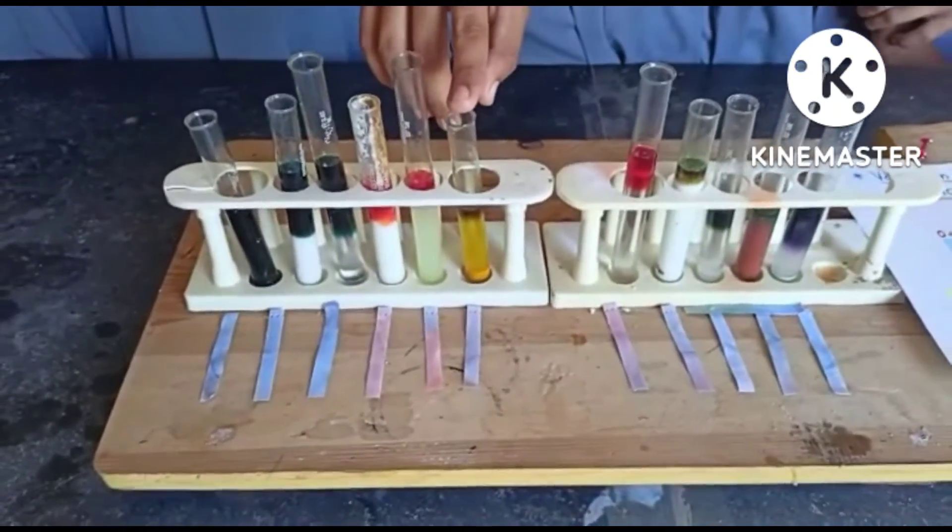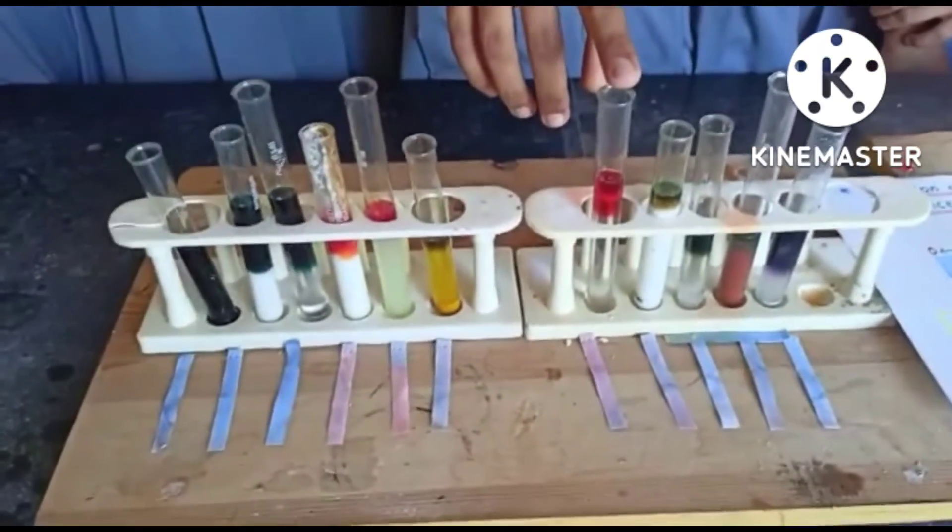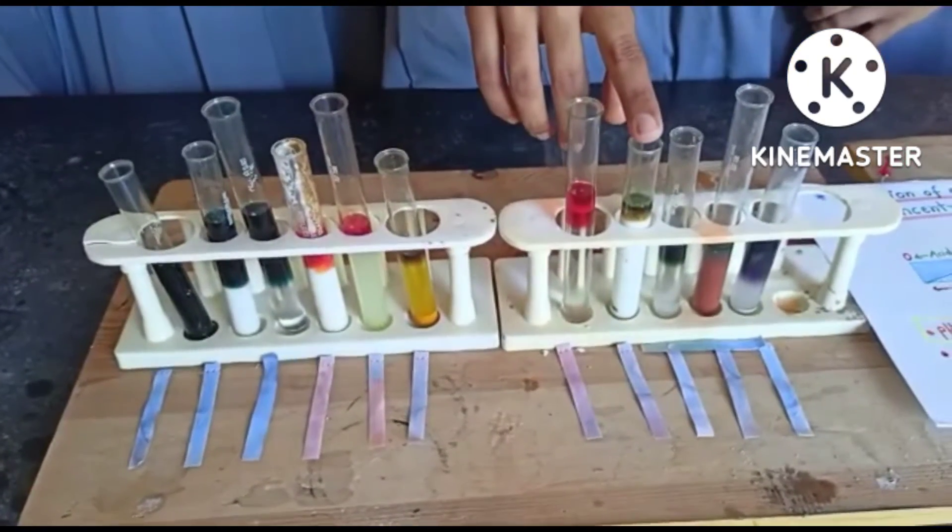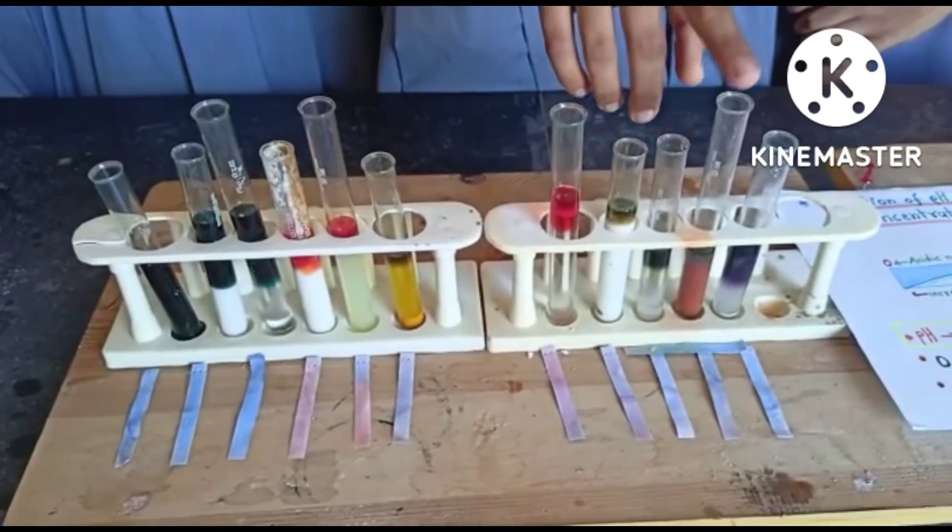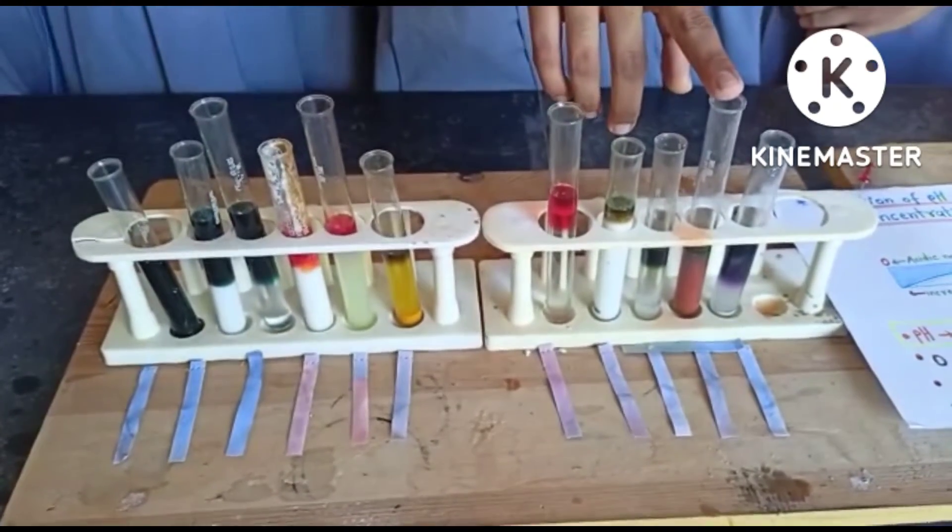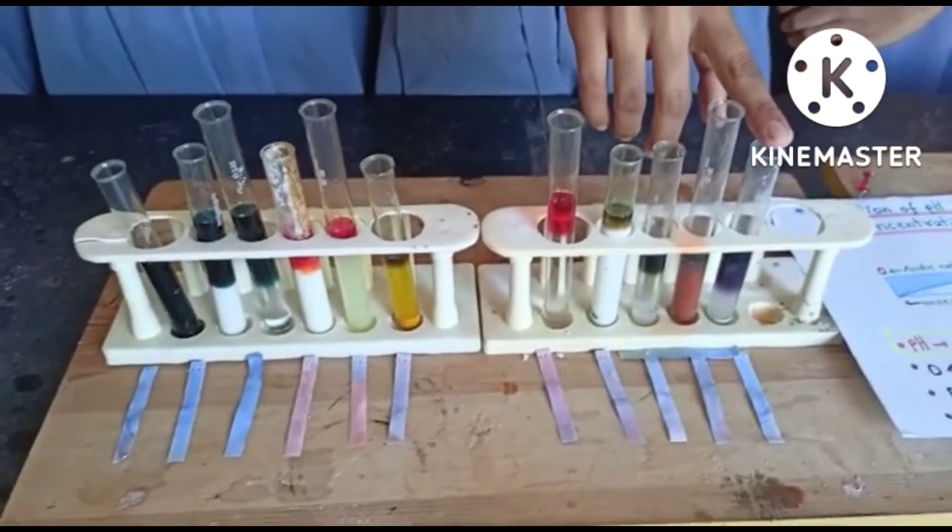The pH of turmeric is 5.9. The pH of vinegar is 2 to 3. The pH of milk is 6.7 to 6.9. The pH of salt is 7. The pH of soy is 6.5 to 7.5. And the pH of washing soda is 11.